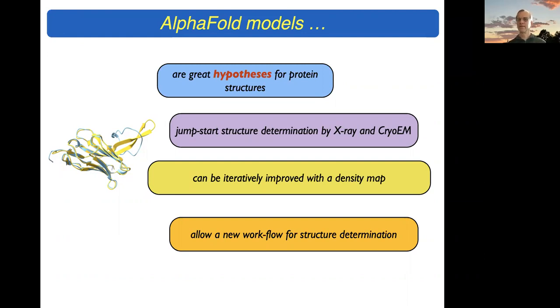A small question, can you recommend some program for fitting in a cryoEM map? Which program do you advise to use to rebuild, optimize a model, or dock it into an EM map? There are numerous programs you can use for that.